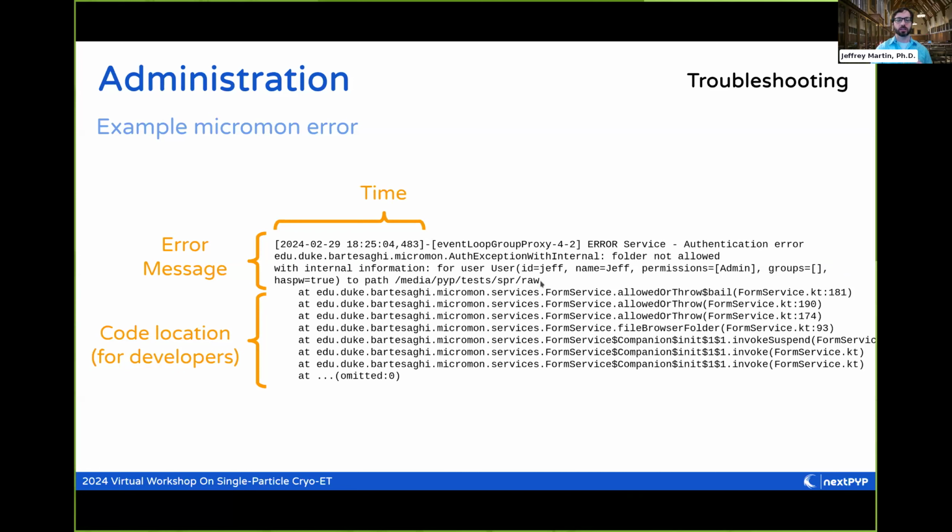And sometimes when you run into problems, it can be helpful to send that information to us. And I'll talk about submitting error reports later on. But you'll find that kind of information in this log. There's also a timestamp to tell you when that thing happens. Sometimes reading these log files, it's hard to get a sense of the timescales things are happening on. So these timestamps are basically the only thing you have.